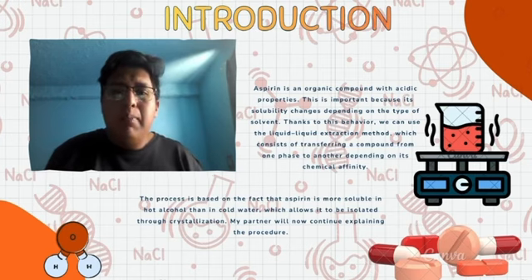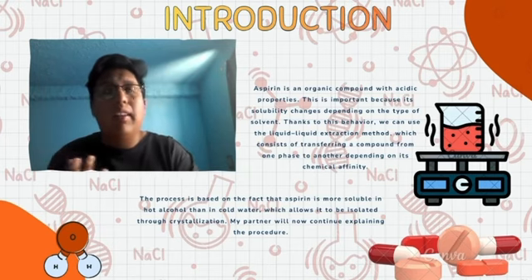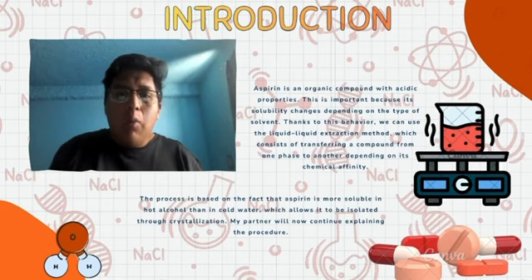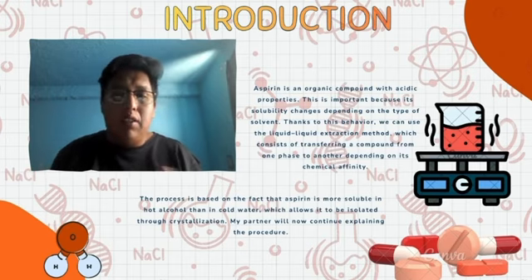The process is possible because aspirin is more soluble in hot alcohol than in cold water, which allows it to be recovered through crystallization.